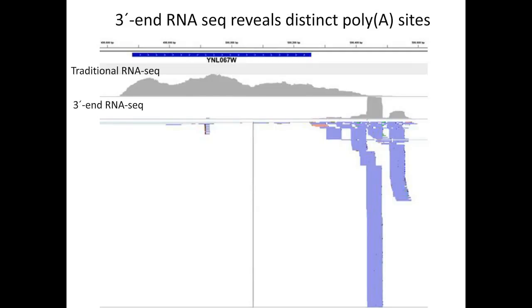So for this particular gene, YNL067W, you can see how the traditional RNA-Seq and the 3' end RNA-Seq provide different advantages for understanding the transcript. The traditional RNA-Seq actually does a fairly poor job of capturing the ends of the transcript. And that's a consequence of how these libraries are prepared.